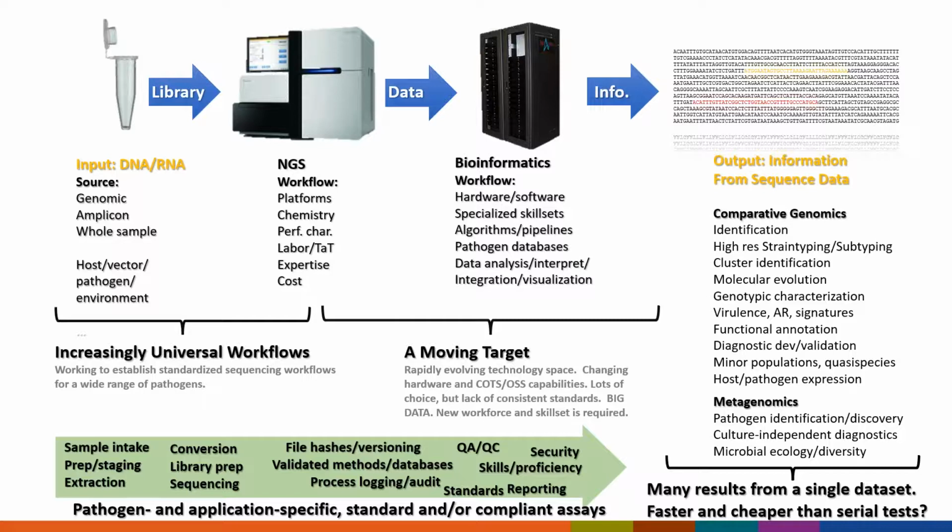As I've said earlier, a lot of the challenges are in the middle part here, and this is where we continue to do a lot of work. There have been a lot of advancements in sequencing instrumentation, kits, and consumables. The bioinformatics itself continues to evolve, and a lot of the methods continue to be refined. But making sure that those are as standardized as possible, that they are as widely applicable as possible, and that they can be performed in multiple labs continues to be an ongoing challenge. Next slide, please.